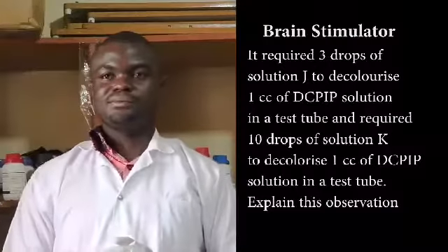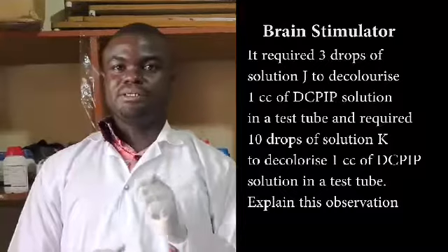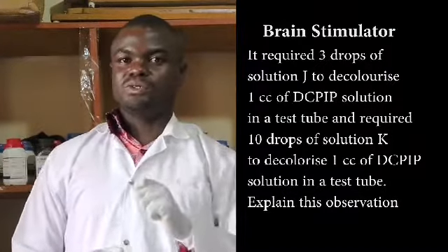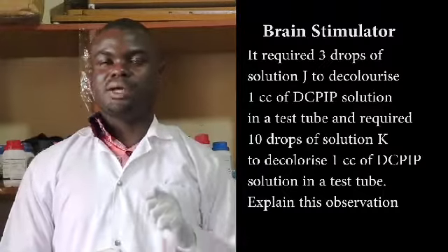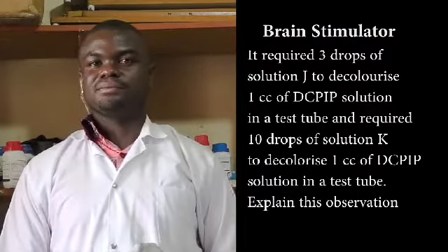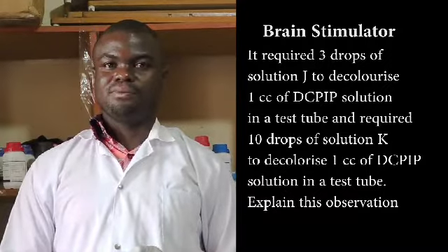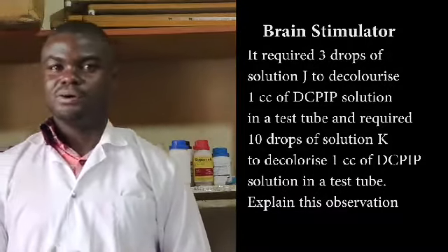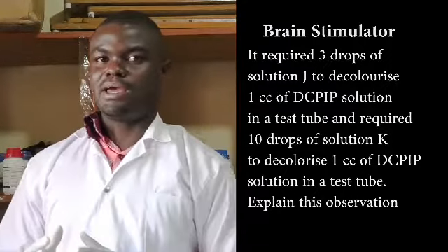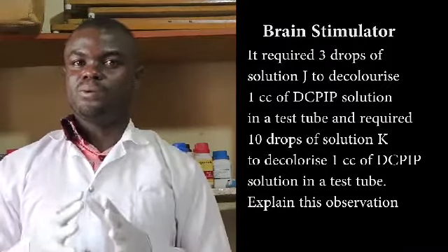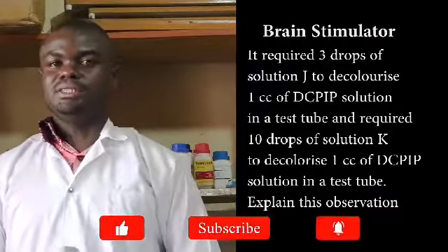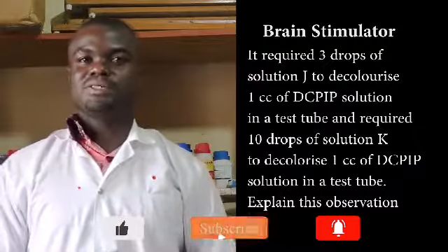And here is your brain stimulator. It required three drops of solution J to decolorize one cubic centimeter of DCPIP solution in a test tube and required ten drops of solution K to decolorize one cubic centimeter of DCPIP solution in a test tube. Explain this observation.